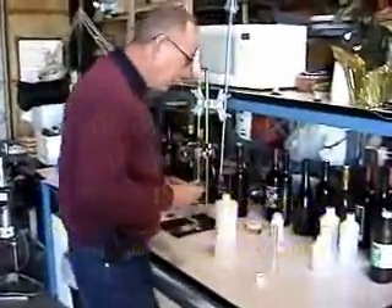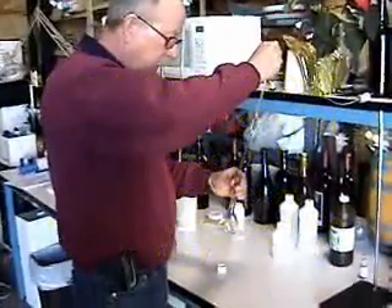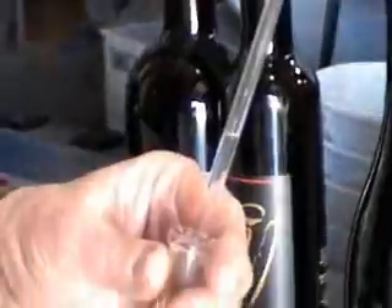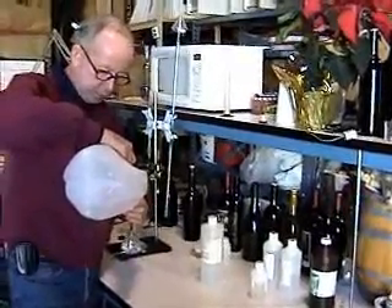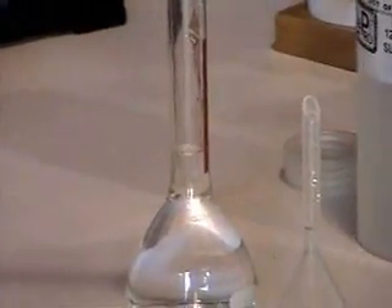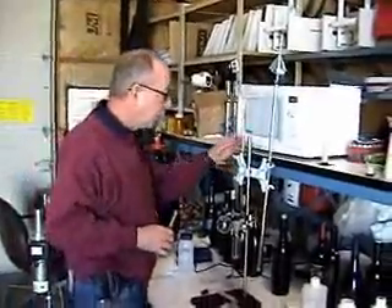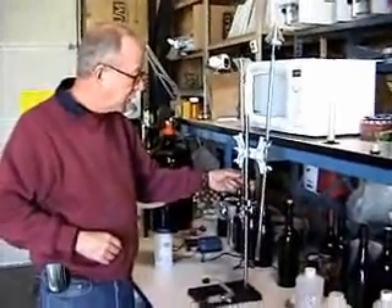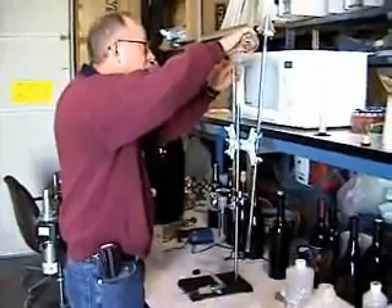I'm going to do a 10 to 100 solution to get to 0.01. We're putting 10 milliliters in the cylinder and filling it up to the mark. Take it exactly to the mark. Once you have your sodium hydroxide solution made up, go ahead and put it into the burette. You don't need to fill it up all the way — it's not going to take very much normally. I'd suggest putting in maybe 10 cc's, which should be enough for three or four analyses.